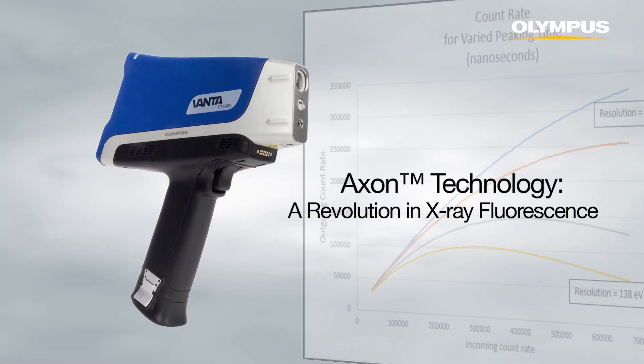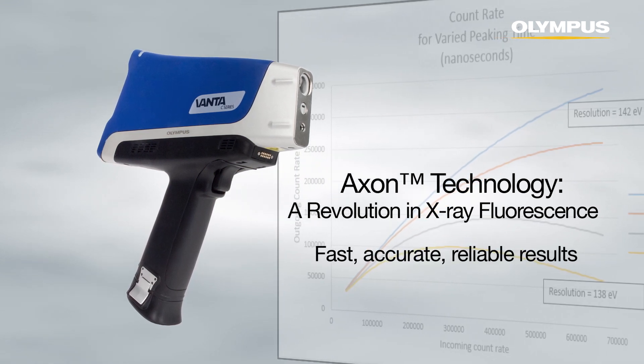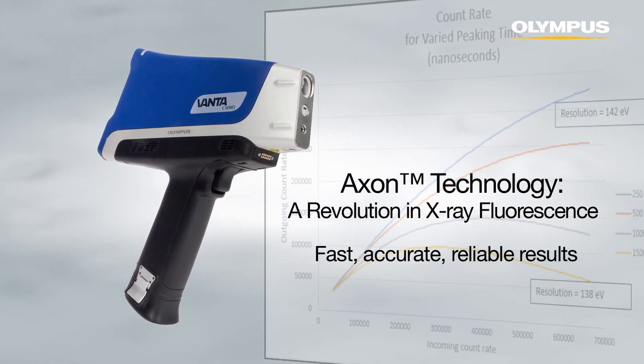Combined with a revolutionary new Axon technology that powers the analyzer, results are faster, more accurate, and more reliable than ever.